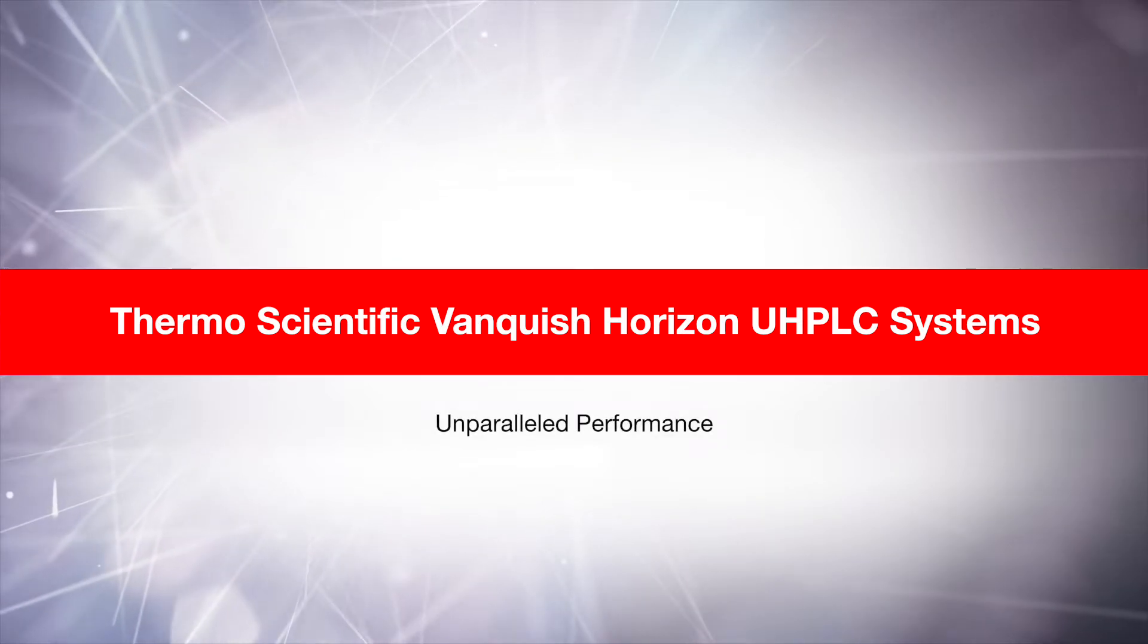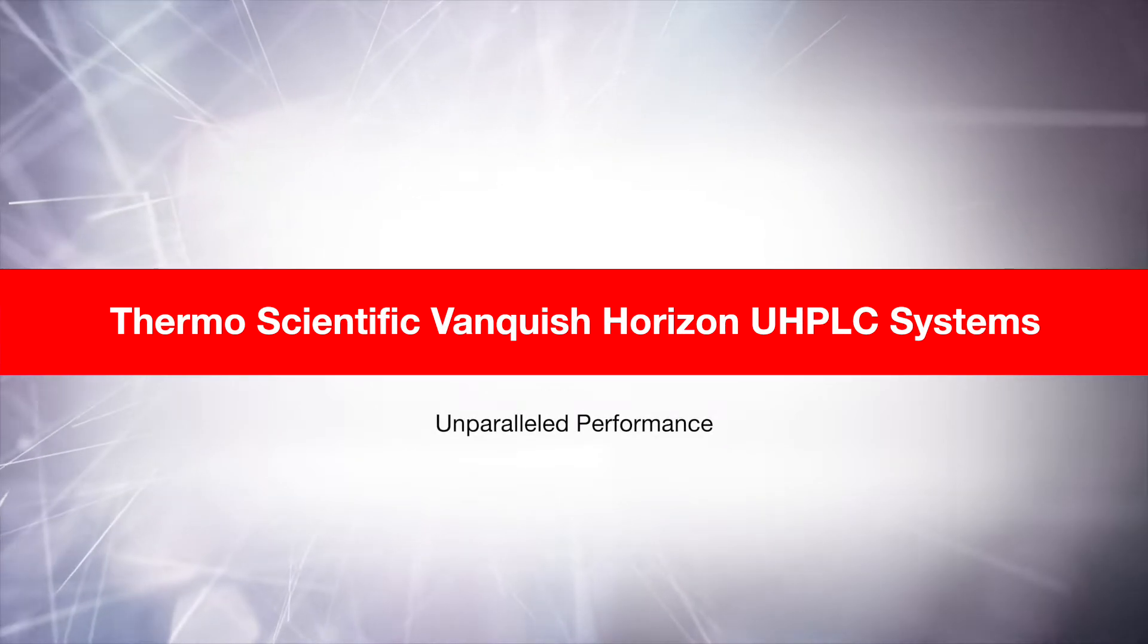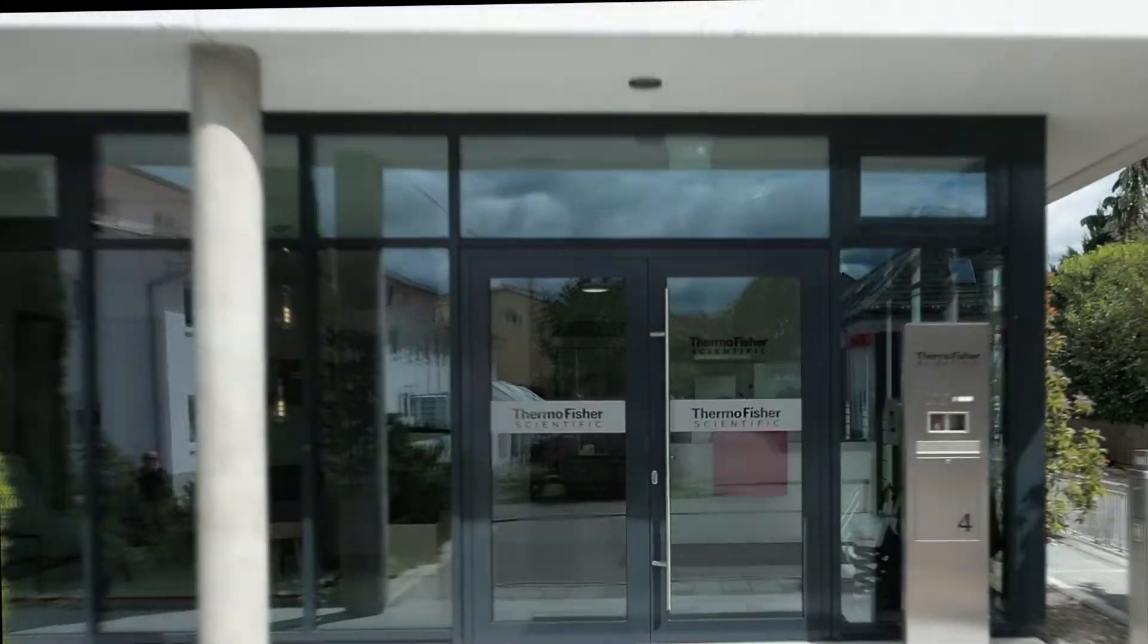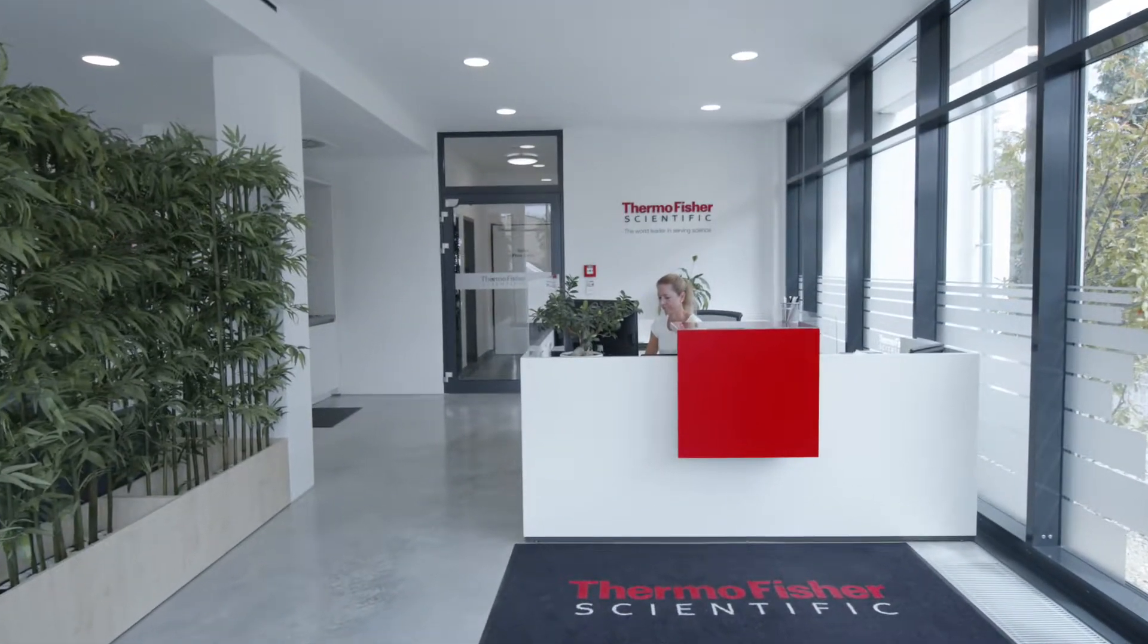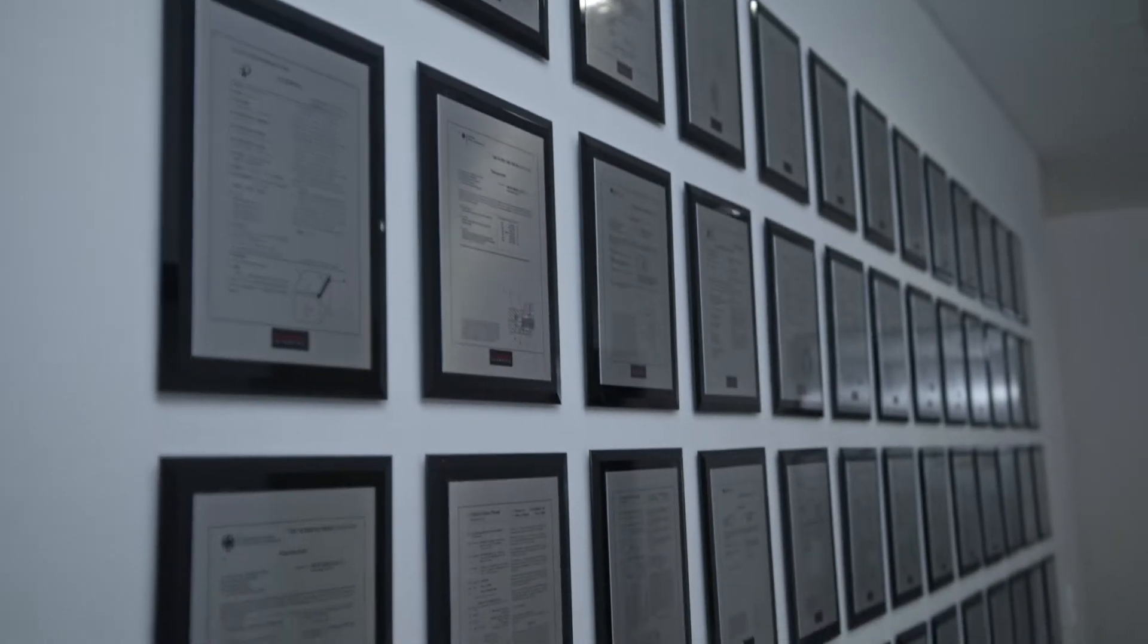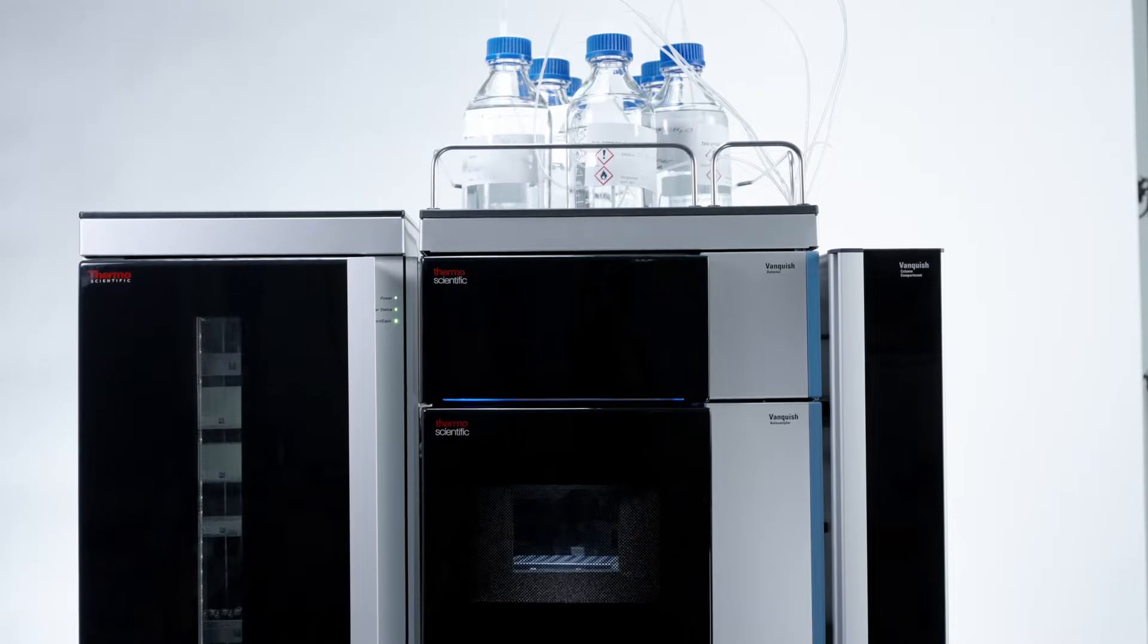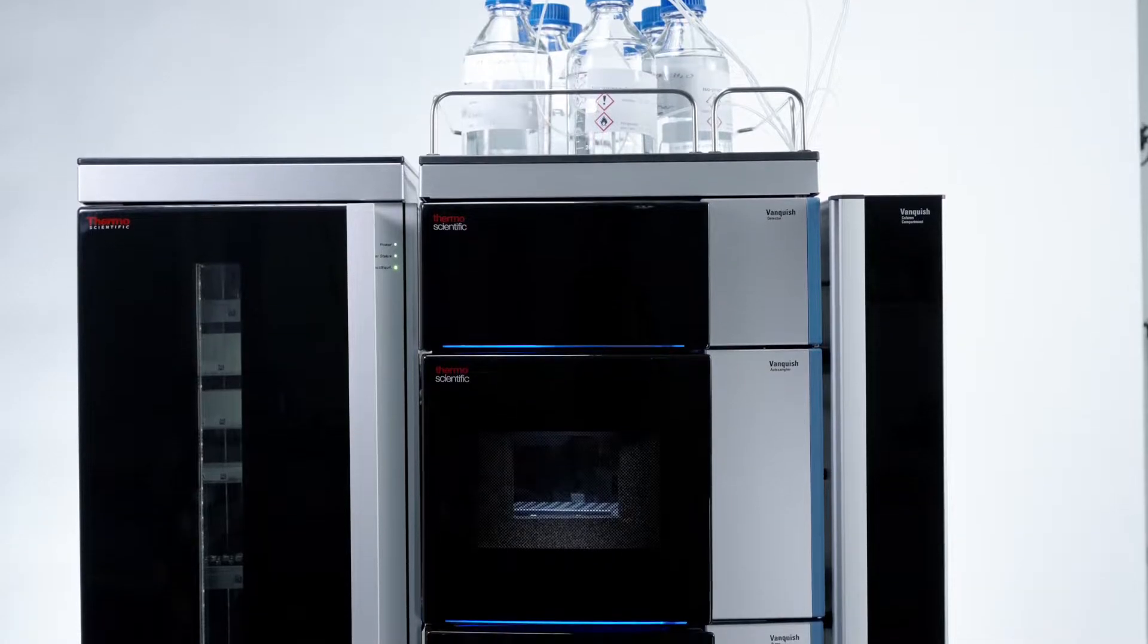At Thermo Fisher Scientific, we strive to support scientists in their uncompromising vision of the future. The Thermo Scientific Vanquish Horizon UHPLC system provides uncompromised performance, robustness and detector sensitivity.